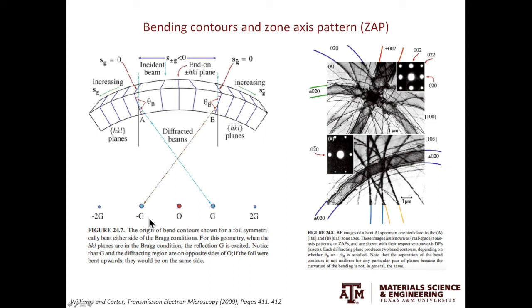Bending contours can offer crystal symmetry information in real space. The zone lines you see here are called real space zone axis patterns or zaps. You can see from the diffraction pattern, it has a two-fold symmetry. This symmetry is also shown by the bending contours. Also at the intersection of the zone lines, you can see a dark patch. And at this patch, the specimen is right on the zone axis.